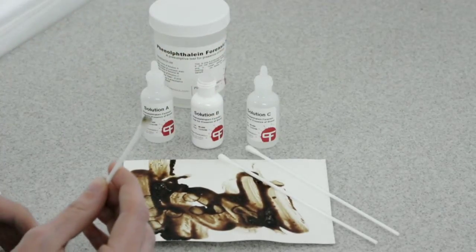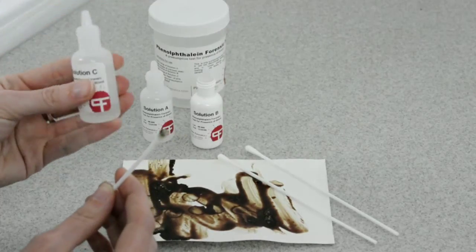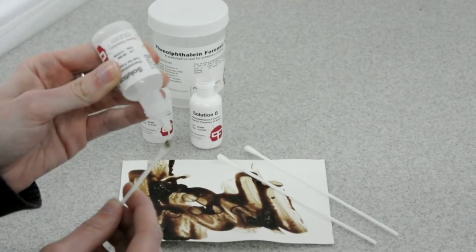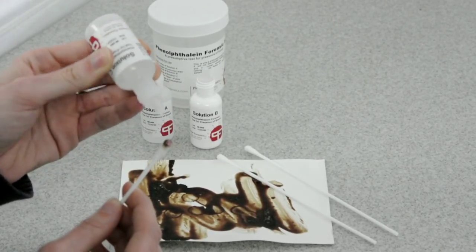You now apply Solution C, which is an oxidizer. If you get an immediate flash of pink when you apply Solution C, that is a positive test for blood.